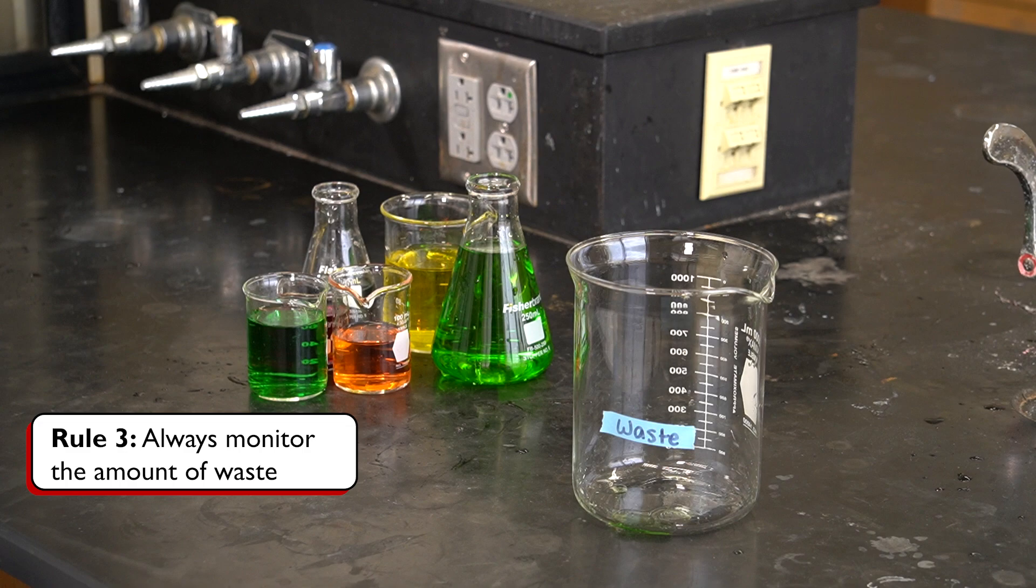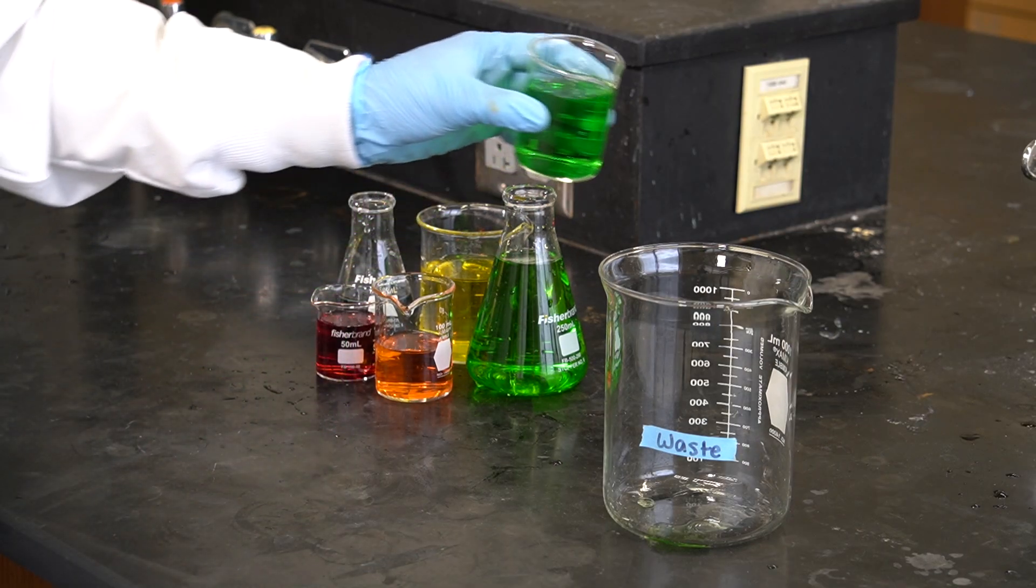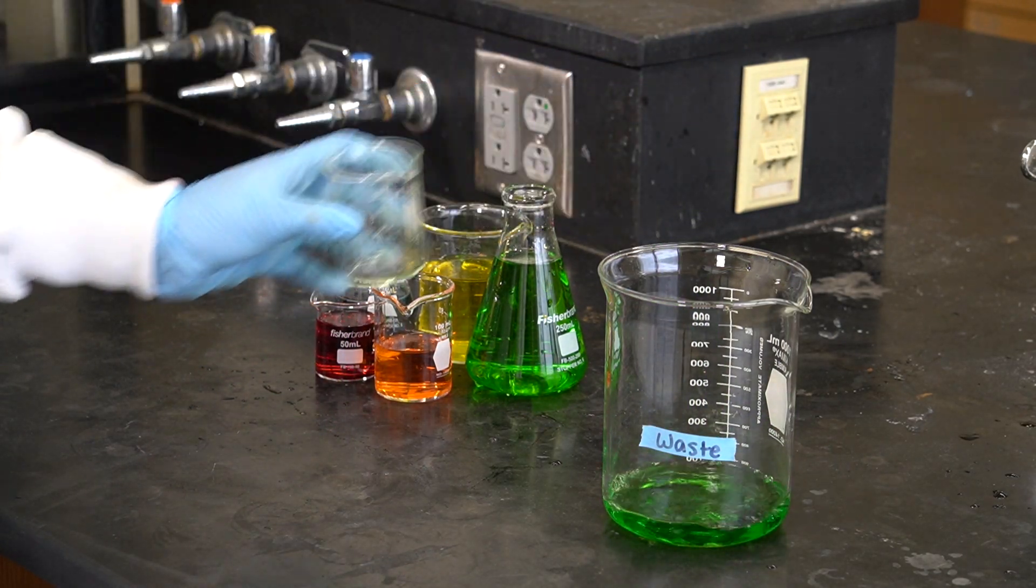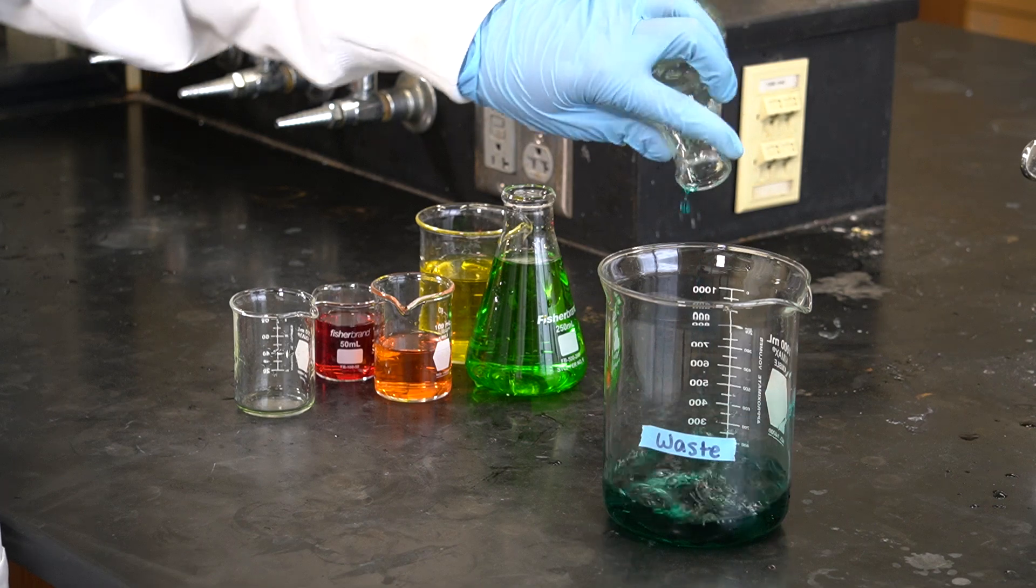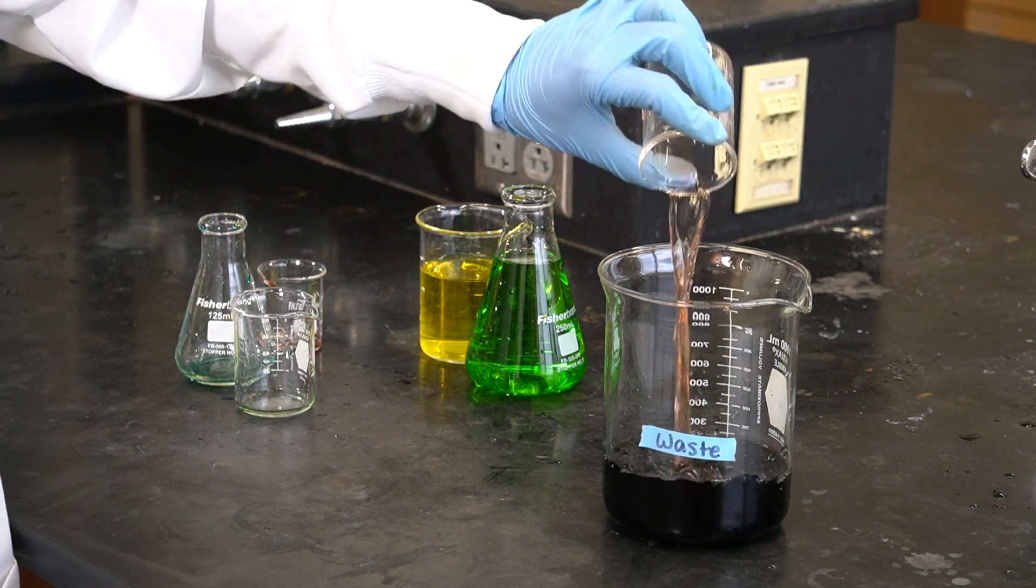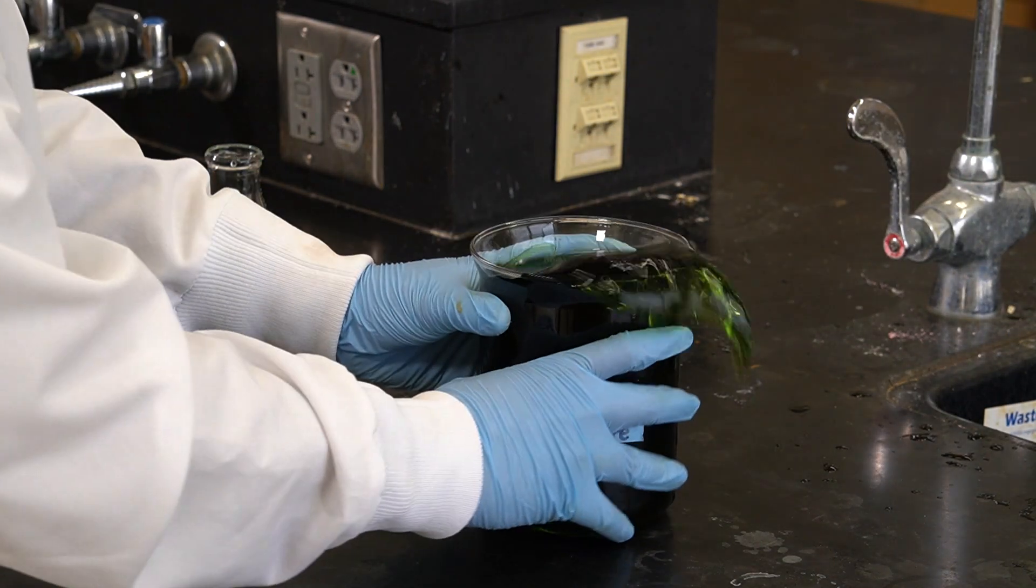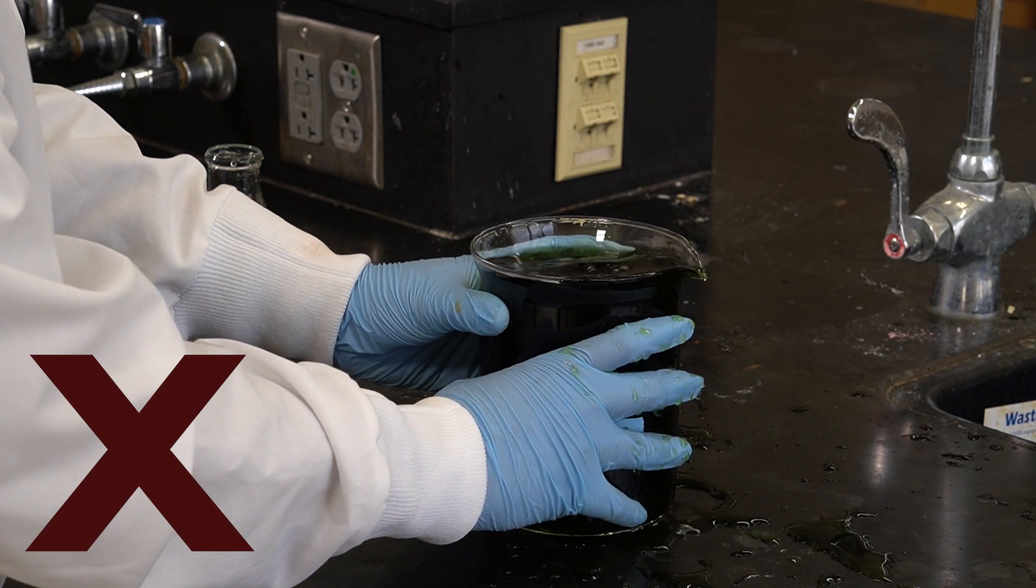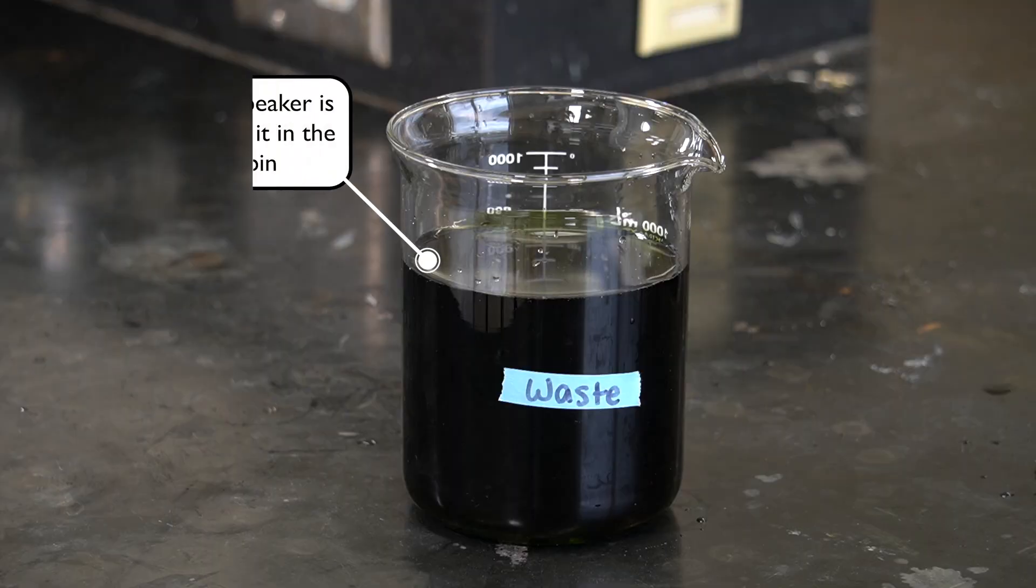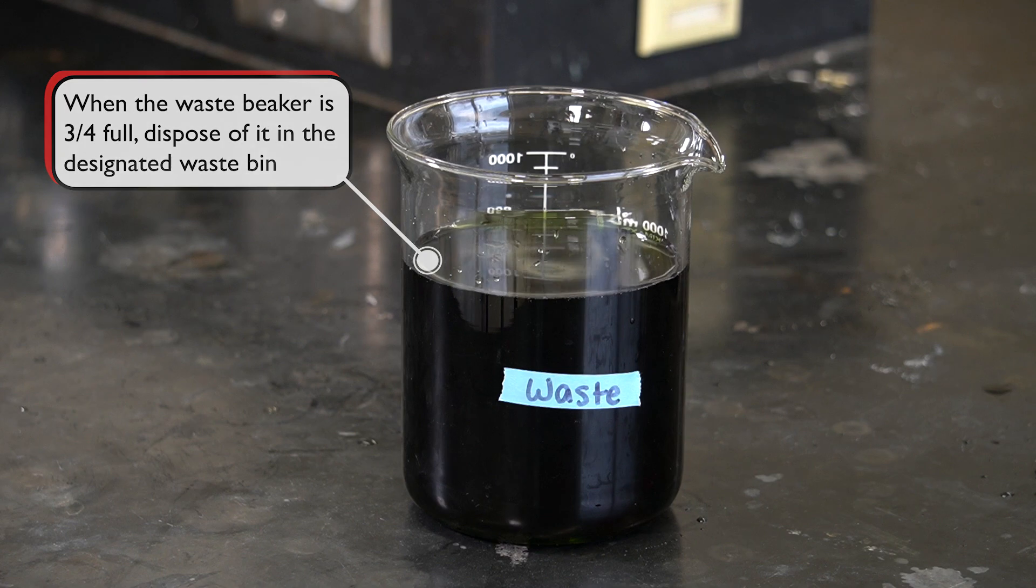Always monitor the amount of waste. During the experiment, we will gradually accumulate waste in the waste beaker. It is important to monitor the amount—you don't want it to fill completely, as it will make transporting the waste beaker difficult and increase the chance of a chemical spill in the lab. When the waste beaker is about three quarters or 75% full, it is time for you to make the trip to the larger waste container.